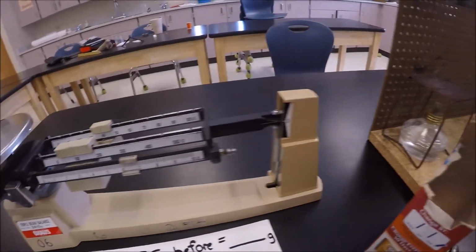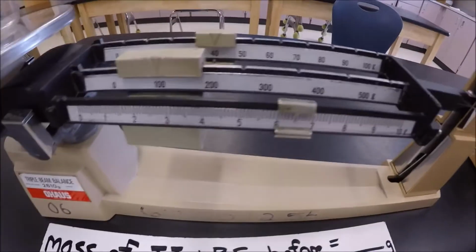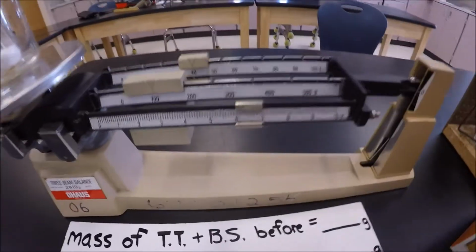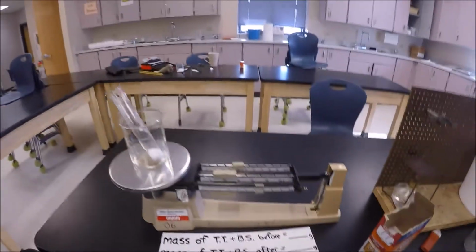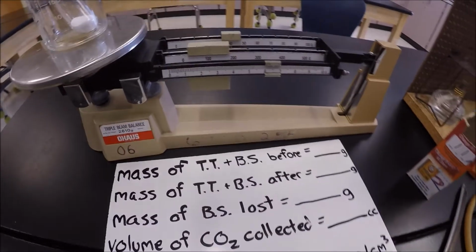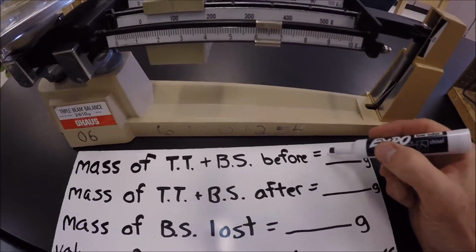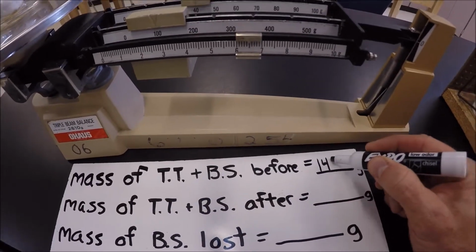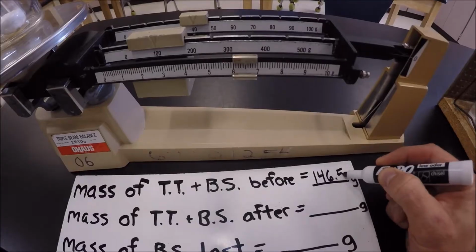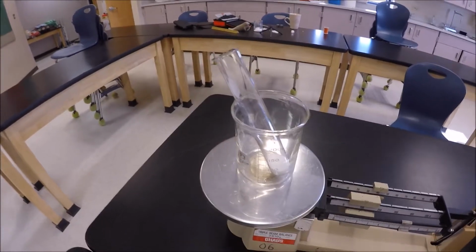And you can tell right there that we are balanced, so we are at 146.5 would be our starting mass before. So again, we're looking at the mass before. We said we're at 146.5. And again, that's all of the baking soda before it's heated.